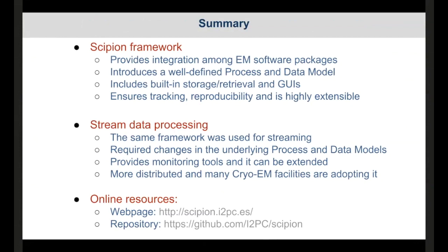And then at the end of the data collection session, you can have a much more advanced data processing for the whole project. And this is also very important to get feedback about the quality of your data, and then maybe make a decision to stop the session and adjust some of the acquisition parameters or move to another sample and make better use of the microscope time.